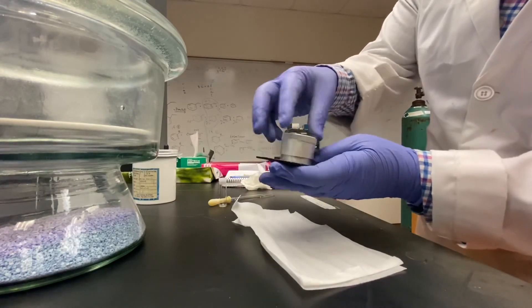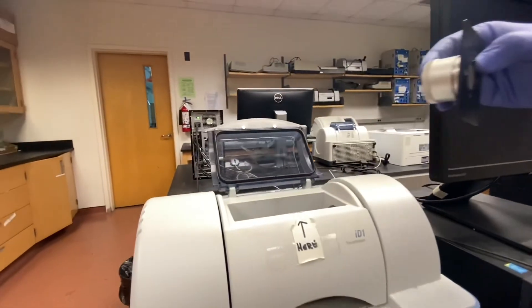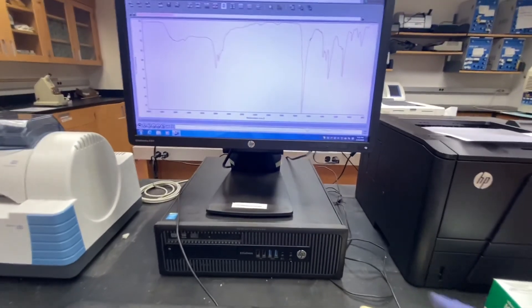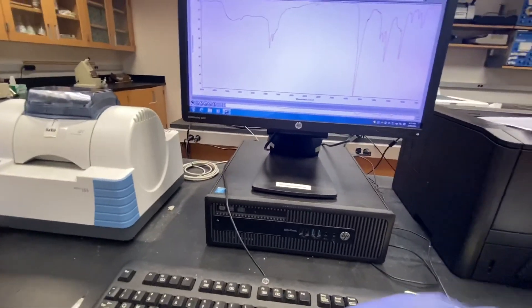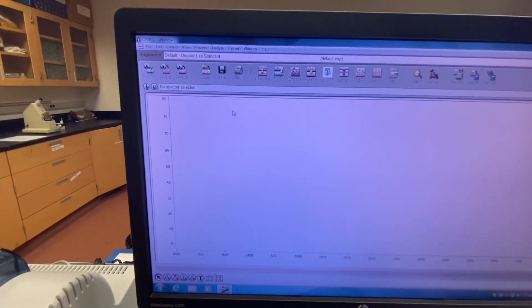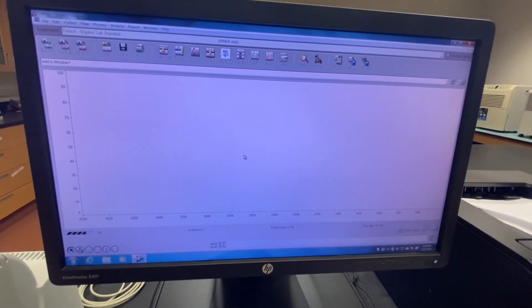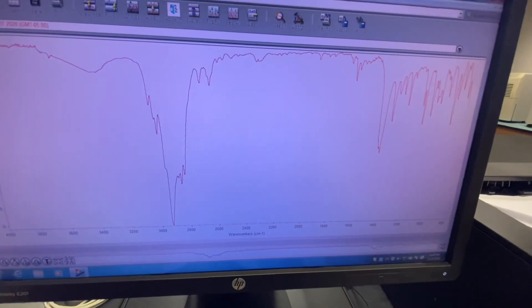Once you make your IR sample ready, make sure you insert it in the instrument and obtain the IR spectra. Once you do the whole process — this was previously done by a student — clear everything on the screen and rerun it as a new sample. This usually takes a few seconds, and once you get your IR spectrum, please make sure you don't forget to take a printout of it.